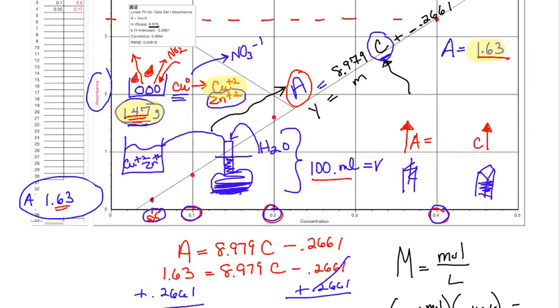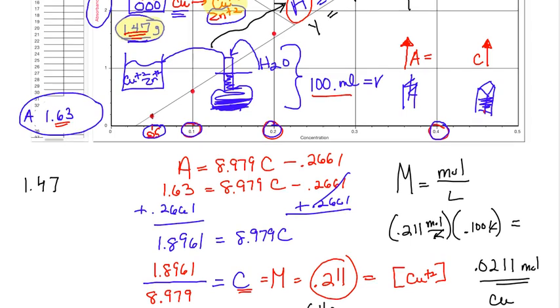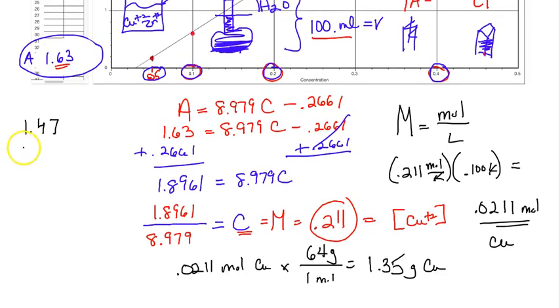Okay. Now, I gave you 1.47, so 1.47 is the copper and the zinc. Remember, zinc is the other element that's alloyed with it. Subtract 1.35. I think we can handle this without a calculator, right? And what we have is 0.12 grams of zinc. The bottom line is 1.47 is the total.